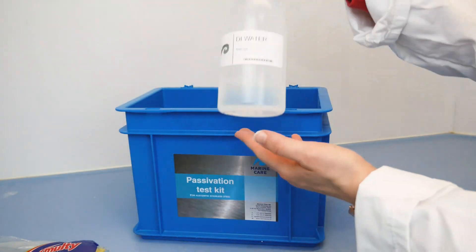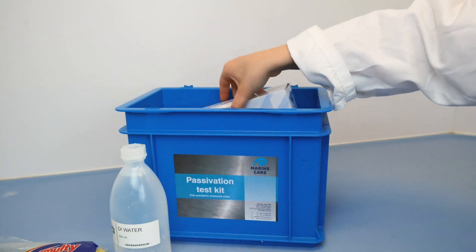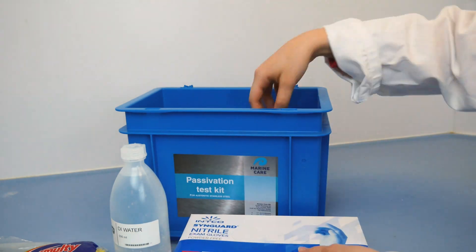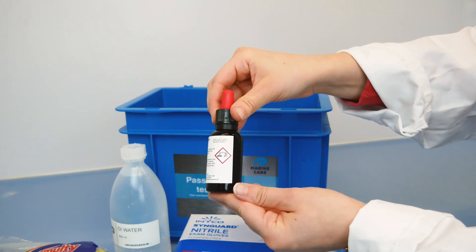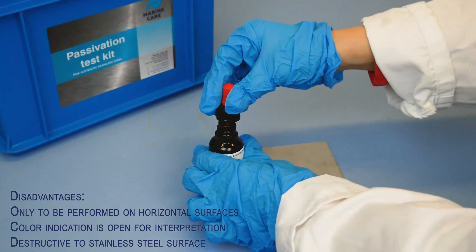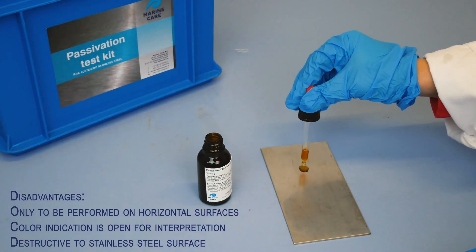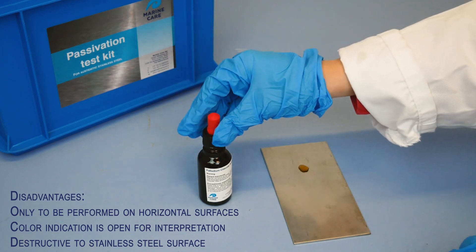The traditional way to verify the passivity is based on a reaction of palladium chloride with stainless steel, which we offer as the passivation test kit. The test can only be performed on horizontal surfaces, the color indication is open to interpretation, and it is destructive to stainless steel surfaces.